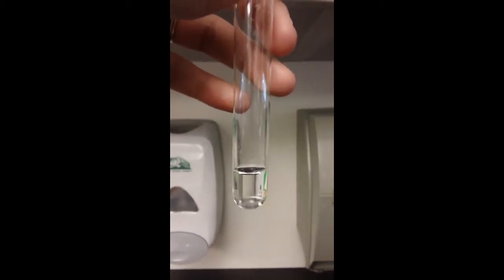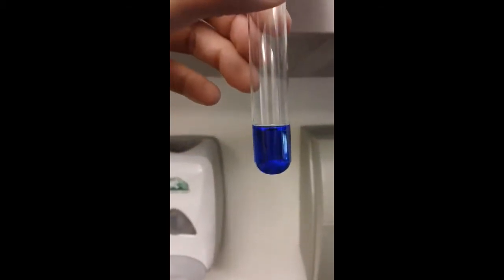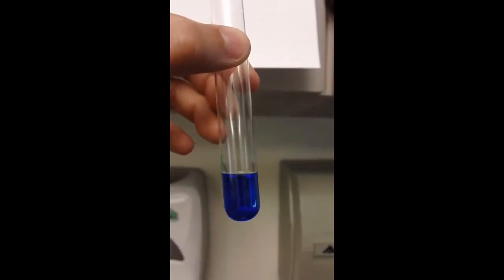None of your boxes should ever have nothing in them. So even if you don't see a change or you don't see a solid, it's really important that you're still writing that down. Okay. Here we have our Cu. Really hard in there. Okay, that's Cu. And our last one is our potassium.